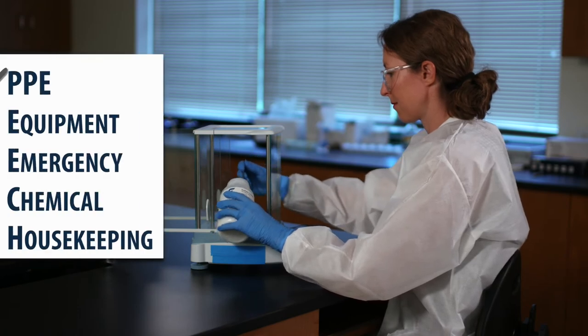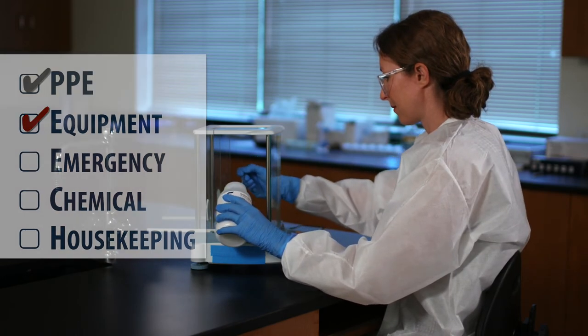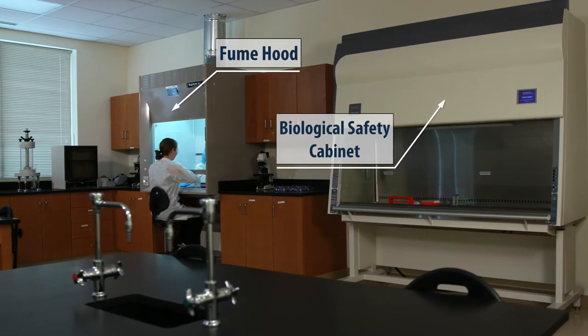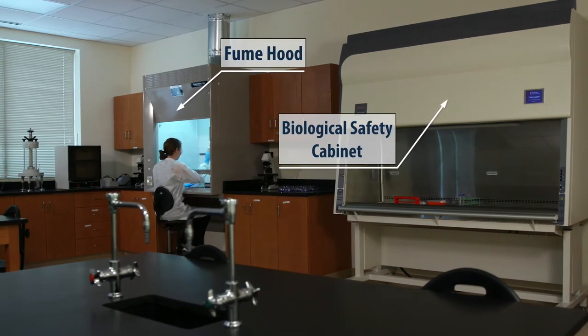Now let's look at some lab equipment. All equipment should be tested and certified to be sure it's in good working order. Fume hoods and biological safety cabinets look similar, but their functions are actually quite different.